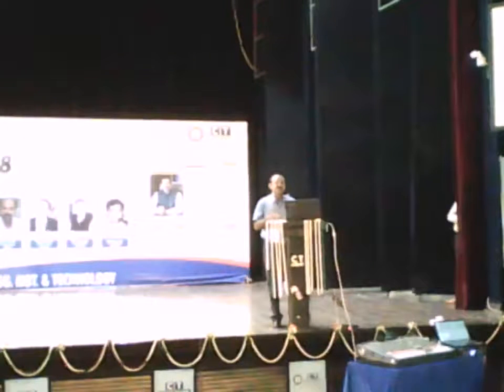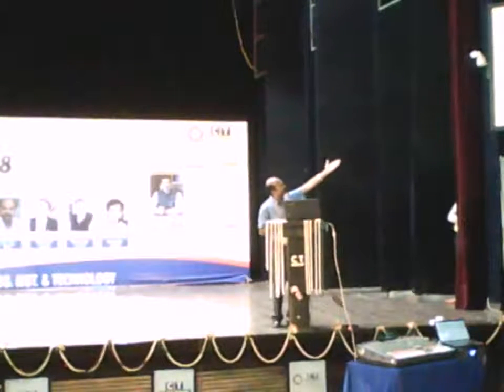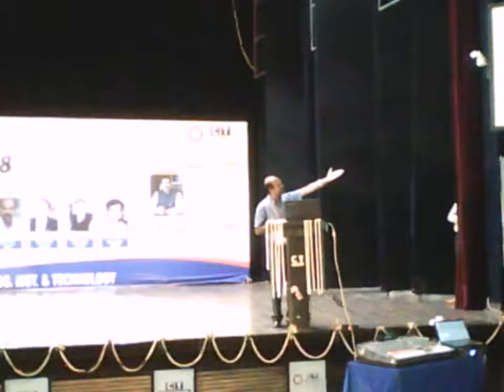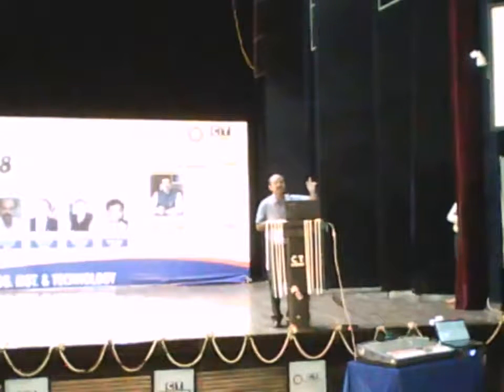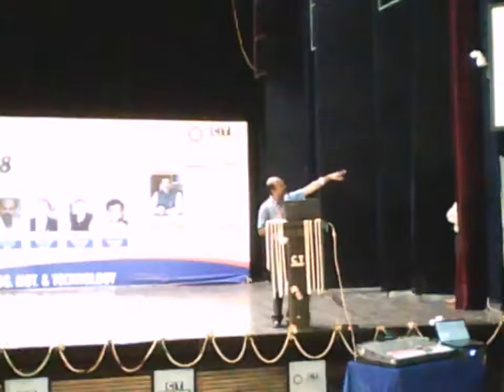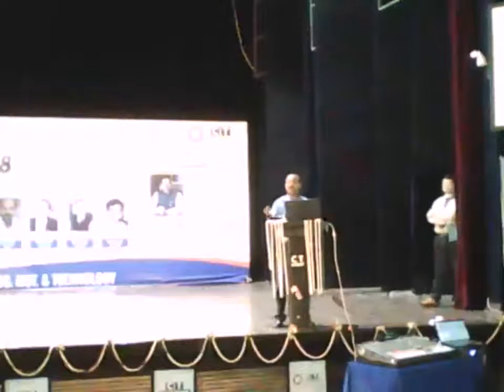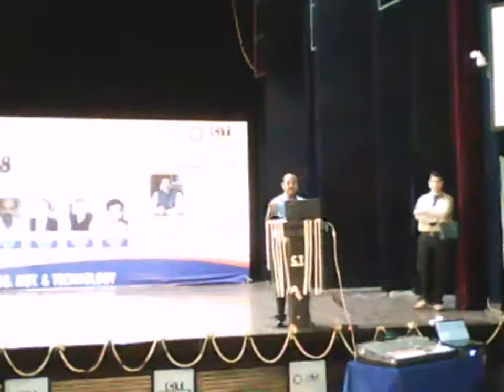It is only for, let's say, gold or silver. If you see carbon, you have only one peak. But in case of gold and silver, you have splitting in the peak. Okay, this is because of the LS coupling, and that can give you the information whether it is gold or it is silver.